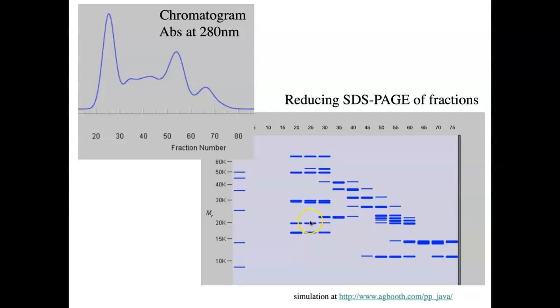Hopefully you came up with the idea that these chains on SDS-PAGE gel, right, may have been attached to larger chains, or they may form multimeric proteins, right? Proteins that have quaternary structure.